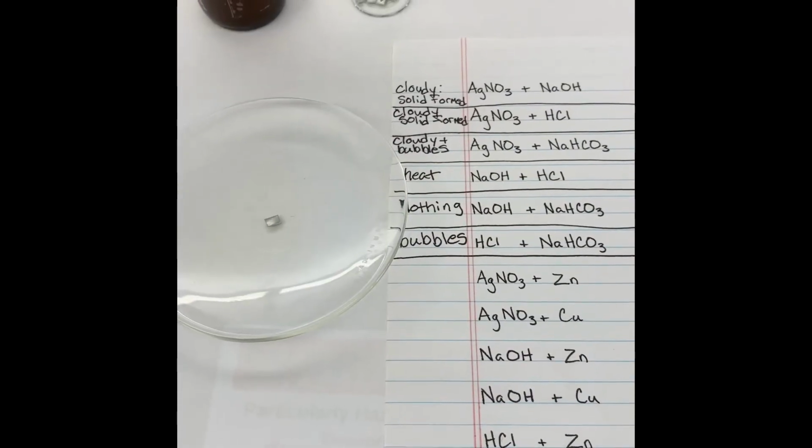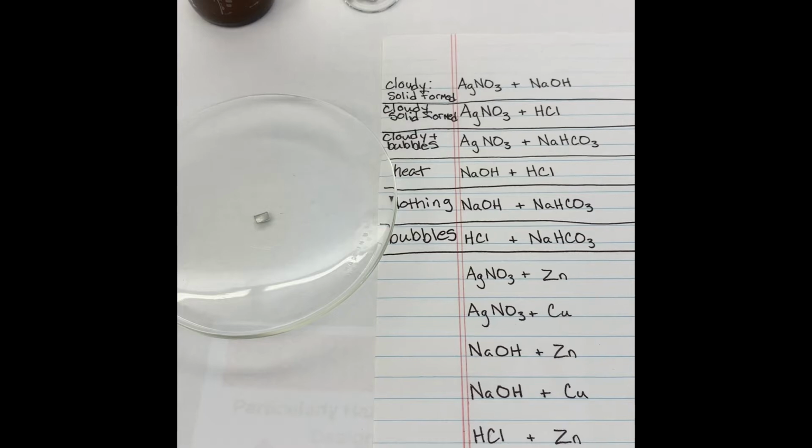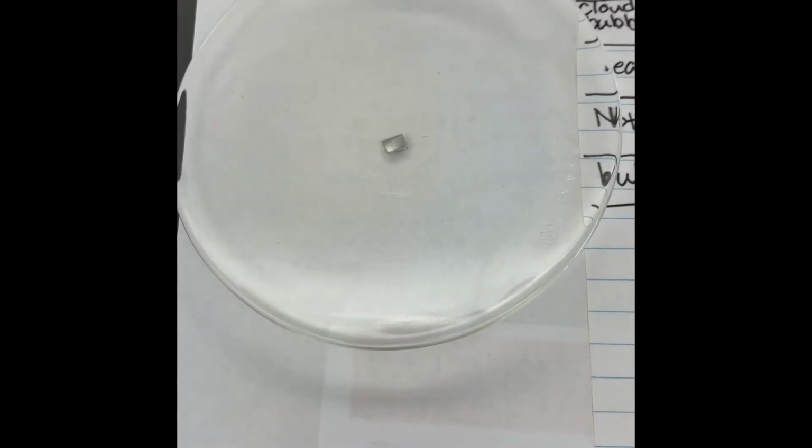Let's look at silver nitrate and zinc. I already have a piece of zinc foil sitting in my watch glass.